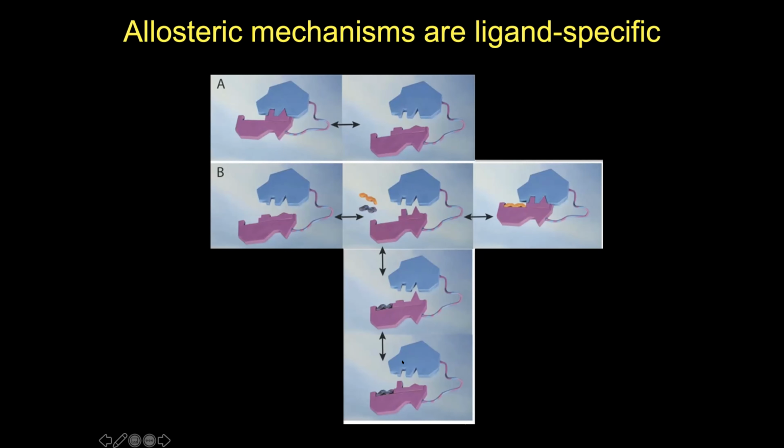It's shown here and here, but as I have shown, there is this crossover or this anti-correlation. So this means either you reduce here the edged, the rectangular shape and boost the triangle, or the other way around. And both of them are really not binding competent with PPIase. And that's why we populate more of these open conformations. But this is just a great example of what you can do with ENOEs.